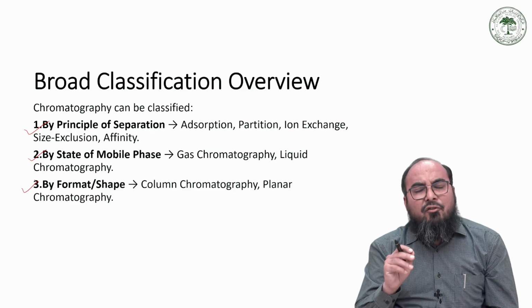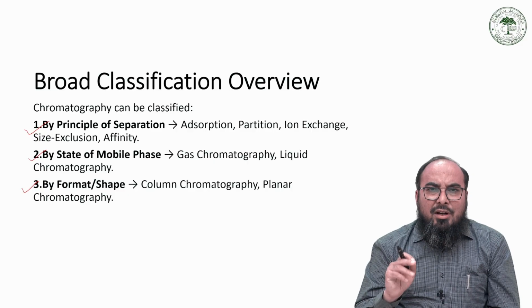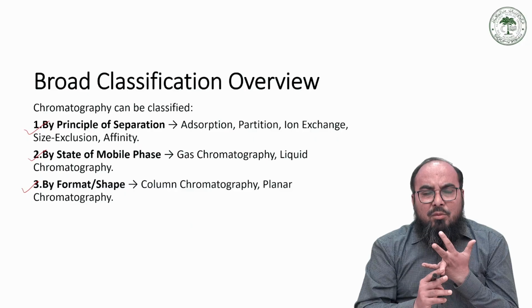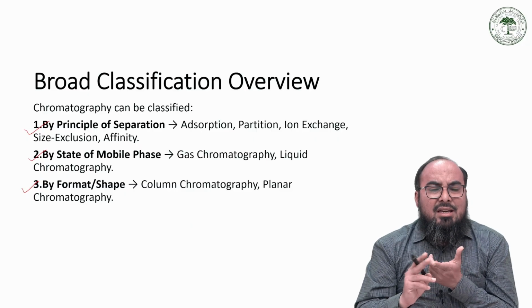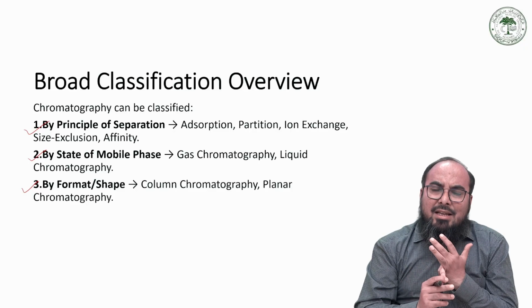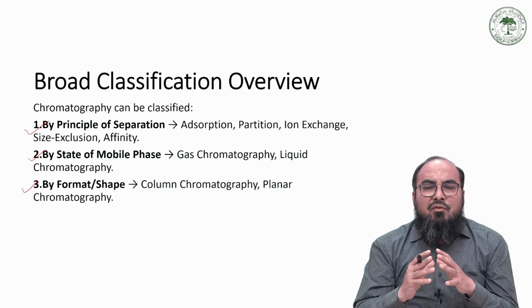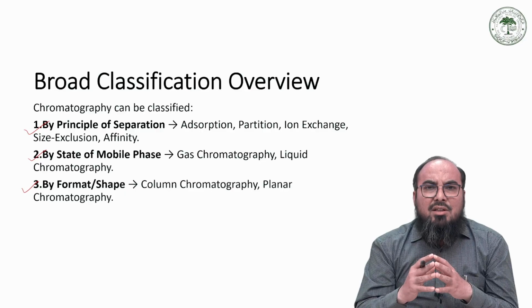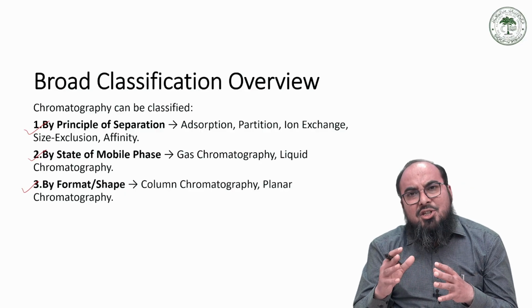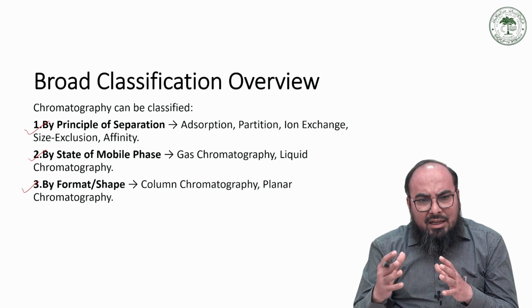On the basis of principle of separation, chromatographic techniques may be classified as adsorption chromatography, partition chromatography, ion exchange chromatography, size exclusion chromatography, and the specialized affinity chromatography, which is exclusively used for the separation of biomolecules. We are going to see each type of chromatography in detail in the coming slides.